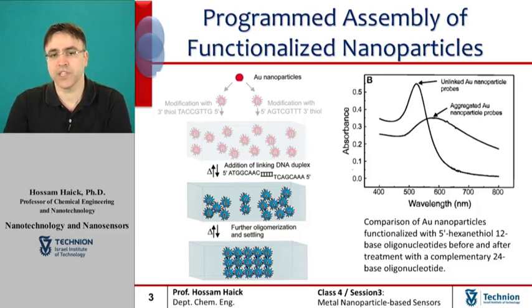This phenomenon changes the absorption of the solution in several manners and can be seen in the graph. The location of the absorbance peak is an indication of the average size of the nanoparticles.